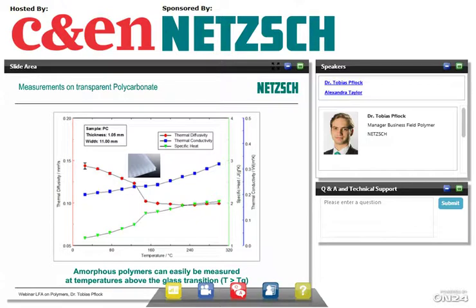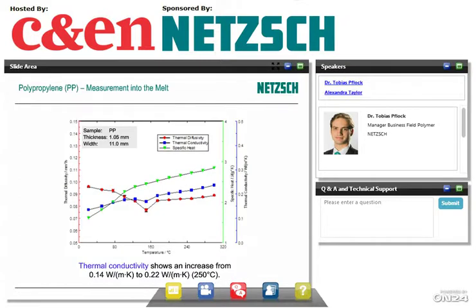The interesting thing here is that we measured this polycarbonate past the glass transition. So we just go over the glass transition. This actually gets quite soft, and we get into the rubbery state of the material. Nevertheless, as we still have this in our sample container, we can just go past the glass transition and still measure the transport properties just within one sample.